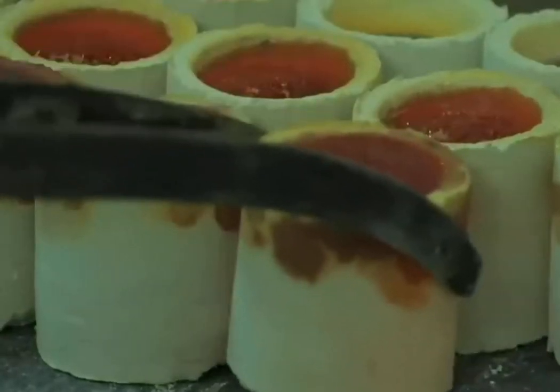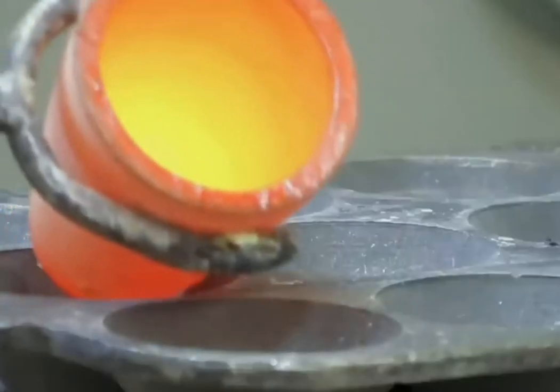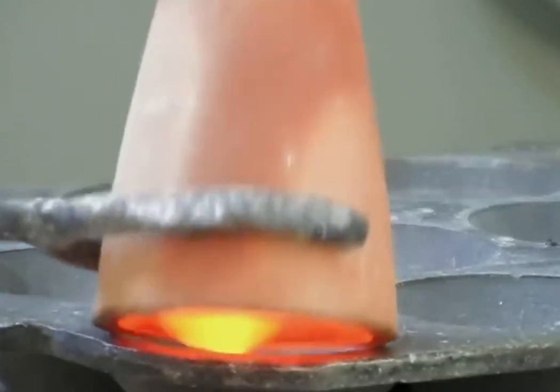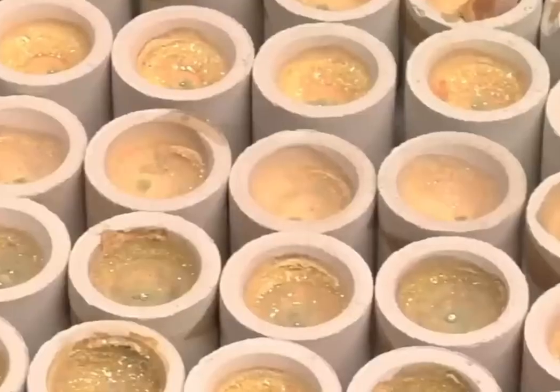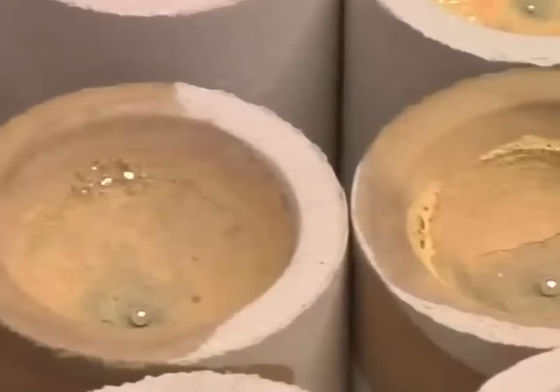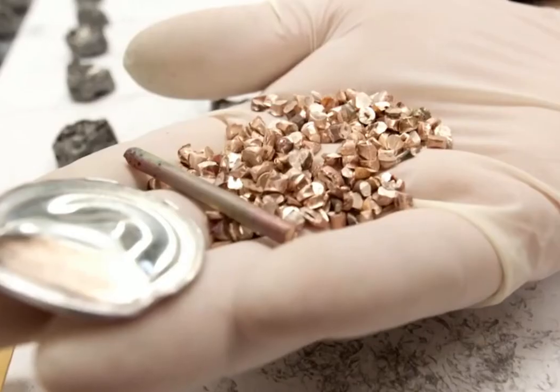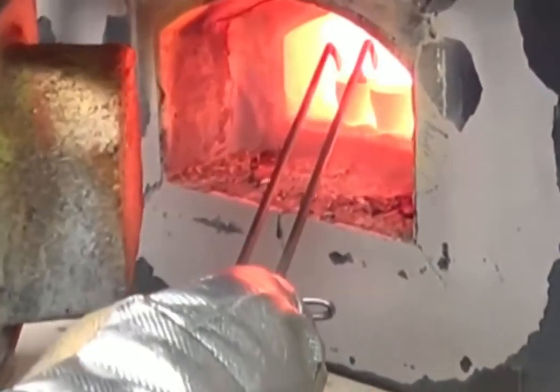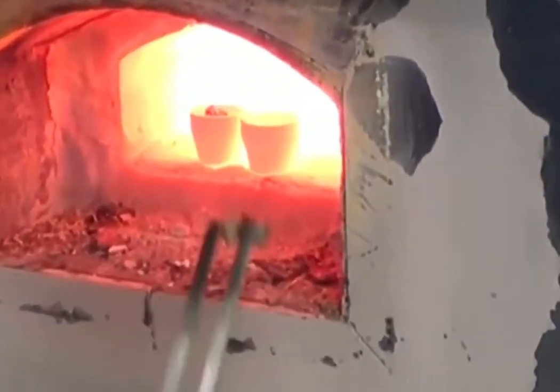Fire assay, also known as cupellation, is a classical method for the quantitative determination of noble metals such as gold, silver, and platinum group metals (PGMs) in ores, concentrates, and bullion. It's a crucial technique because it provides highly accurate and precise results, making it the standard method for assaying precious metals for centuries.